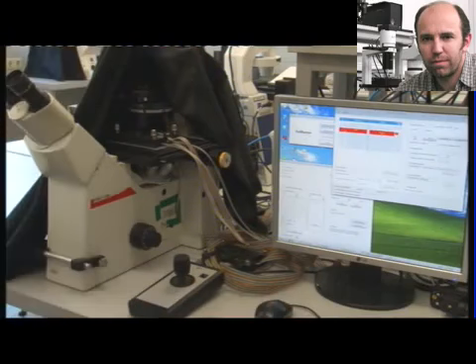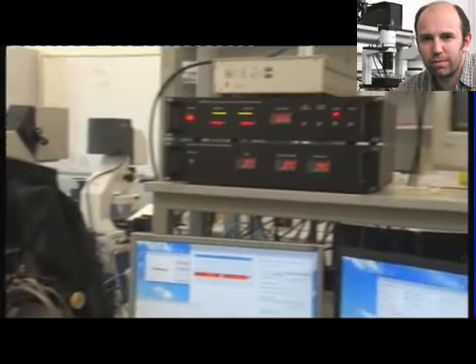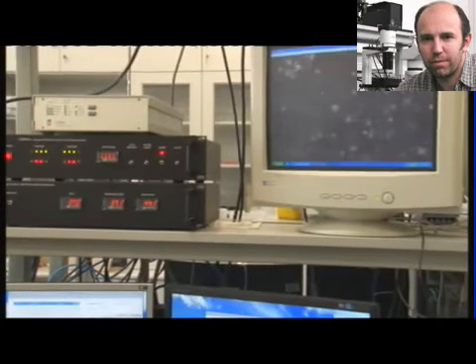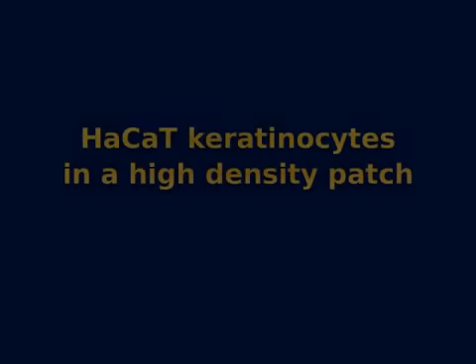We selected the fields of view manually and stored their positions in the computer. The time-lapse program moved the stage into the stored positions every 10 minutes and captured single images, which were then used for time-lapse videos or motion analysis.